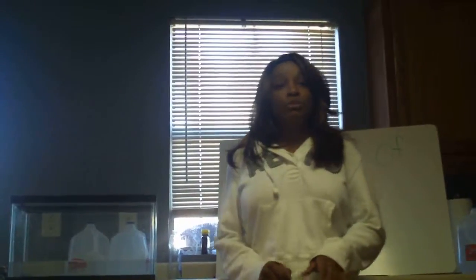Electrolysis of water is the decomposition of the water molecule to form oxygen O2 and hydrogen H2 gases, and this is due to an electric current being passed through water. Today, ladies and gents, I want you to think about a few things during this experiment.